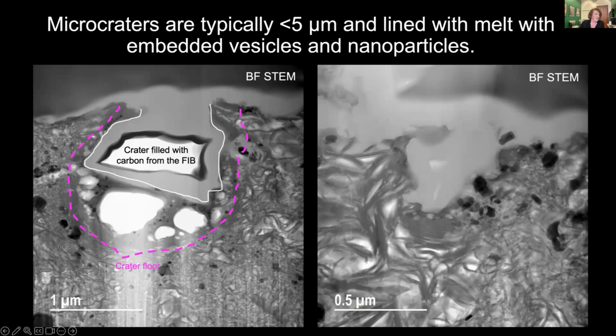So by studying the composition and distribution of these minerals, it can tell us about how much water there was present in the early solar system and available for asteroid Bennu. We can also look at these little Dalmatian spots, or these nanoparticles that form at the base of this microcrater, to try and understand what their composition is, what their mineralogy is, because that impacts how the optical or spectral characteristics of the surface are altered through the space weathering process.